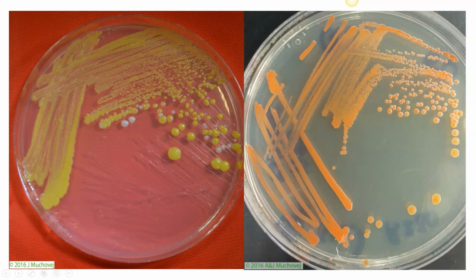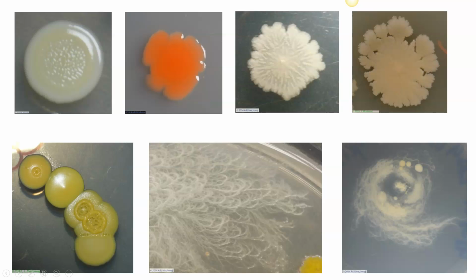When you look at bacteria, since they're single-celled, they grow and they reproduce and they form these colonies. They're really kind of individual cells on the inside of them. Here are some other formats of colonies of bacteria. You can see things like the shape of the margin. You can see the format of the material on the inside, how it seems to grow in certain ways. The one on the bottom right I call my hurricane. Bacteria, when they grow, different colors, different shapes, different formats. They're very interesting, but all of these tendencies here are really genetically controlled.